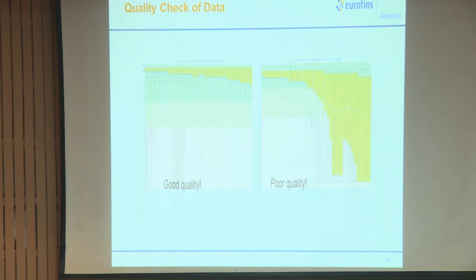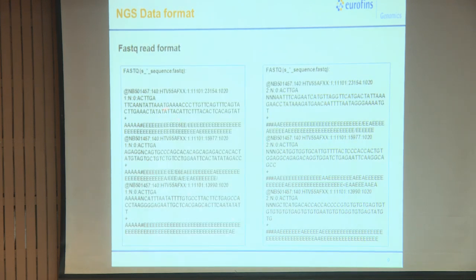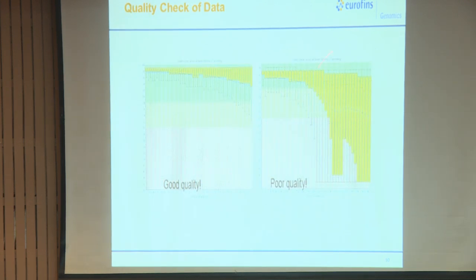Then once we have done the sequencing, we do a QC of the reads. How do we do the QC? We do the QC based on this and this. This is my quality, so I do not want any poor quality reads to be there. How can we identify that? Based on these graphs. If I have dropping quality to 2, which would be a poor average quality, I do not want it. If I have a read like this, I filter it out.